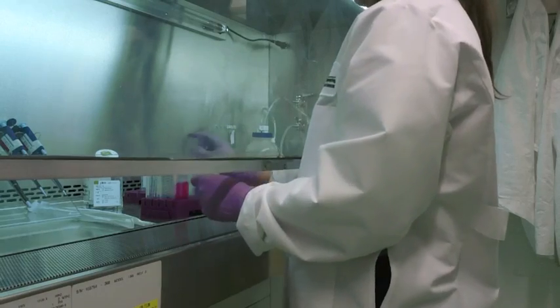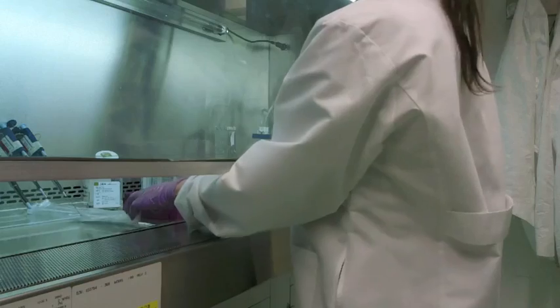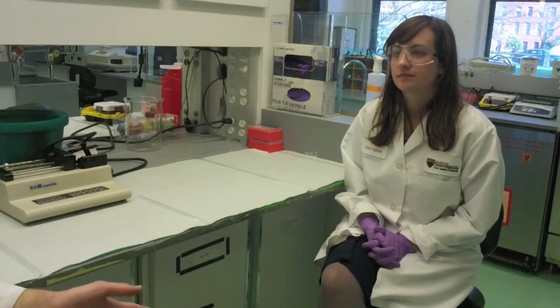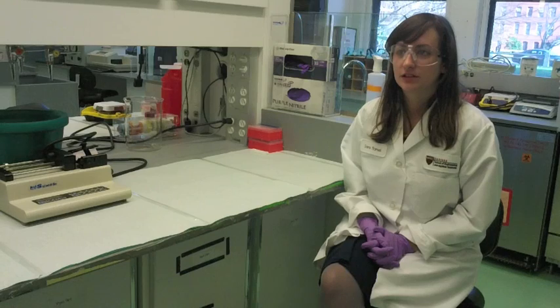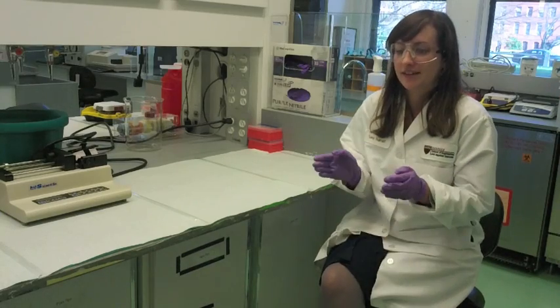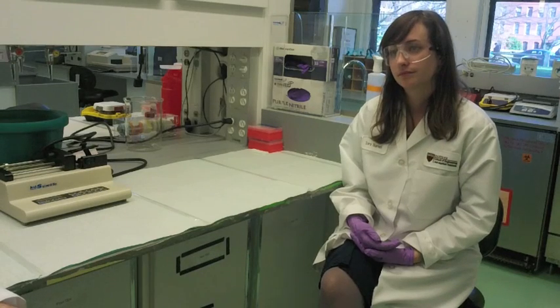To begin my exploration of this problem, I sat down with Sarah Hamill, who runs the undergraduate bioengineering teaching labs at SEAS and keeps up several cell lines throughout the year. So how often do you have to go do this process for your job? So renewing media definitely at least 2 to 3 times a week. Passaging the cells, that's at least once a week again. So you're working with the cells. At least you have to have a designated couple hours, 3 to 4 times a week to actually keep up your cell line. How long does the process take?